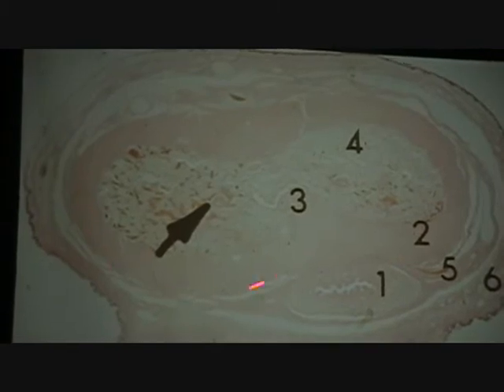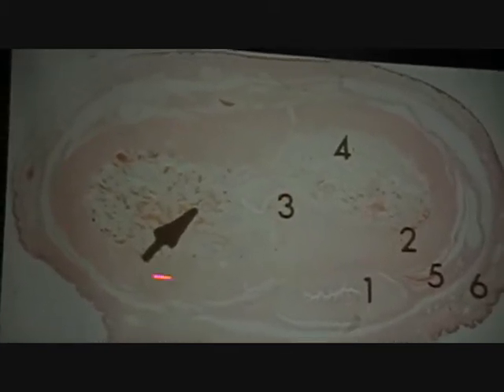Thyroid, and the figure 8 for tunica albuginea. Great, thick, strong connective tissue within. So this keys you in on the penile cross section. That's the dominant structure.